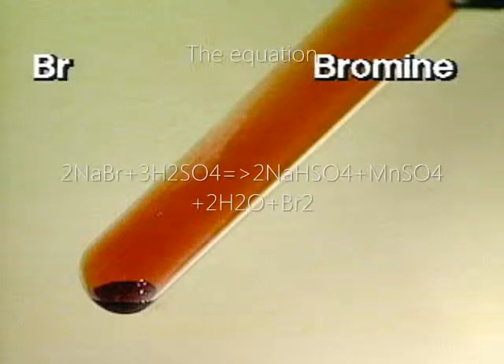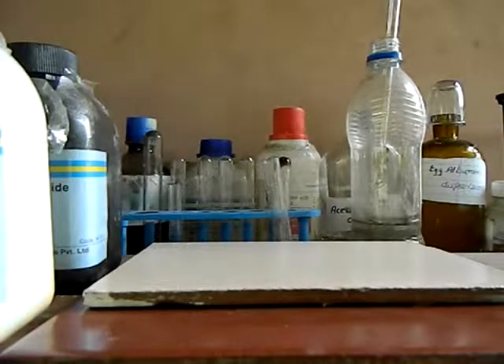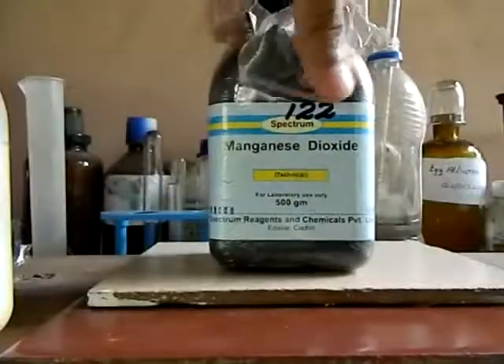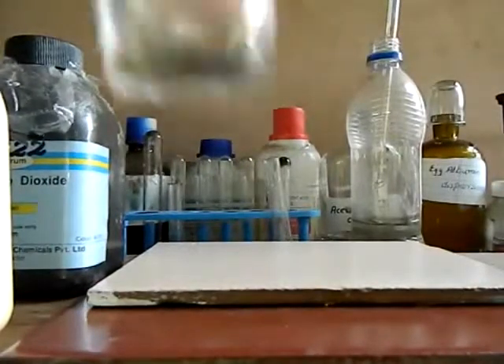In this session we would be using elemental bromine and bromine water. For this session we need sodium bromide, manganese dioxide, and concentrated sulfuric acid.